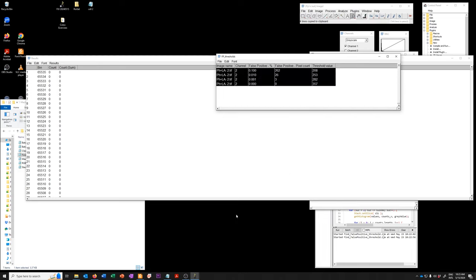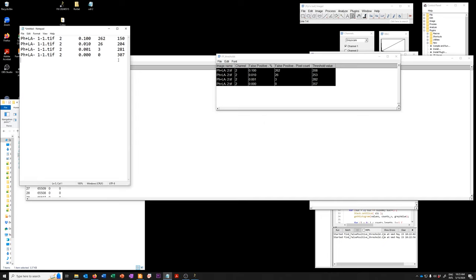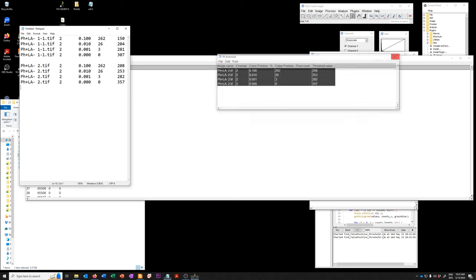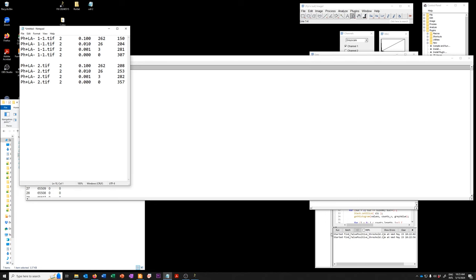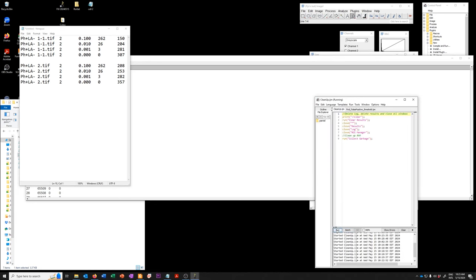And I'm going to do it one more time. I have six, I'm not going to do it on the six, but I just want to illustrate how things might vary. I'm going to clean up my windows.